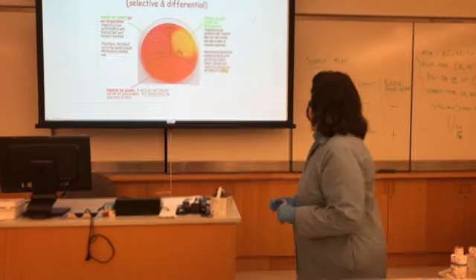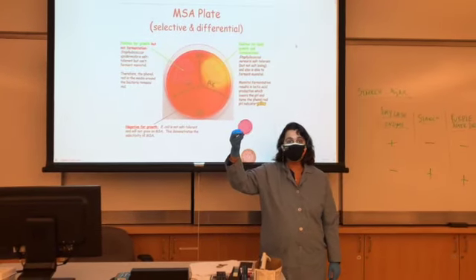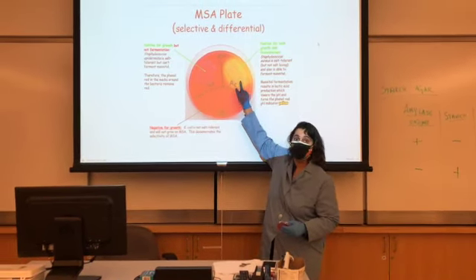Okay, all right, so here you can see the original MSA plate, and look at how you can see the change in the color when you have bacteria that can ferment the mannitol sugar. Okay, so in the lab we have some bacterial plates done by our students, and look at the color change. So this MSA plate has been divided into 3 parts, and we added E. coli on one side, Staph aureus on the other side, and Staph epidermidis on this side.